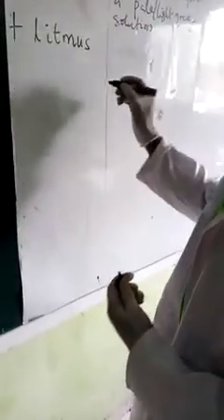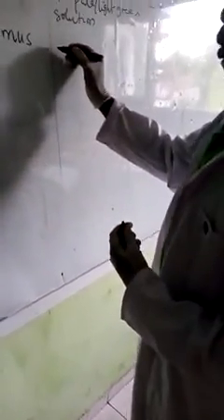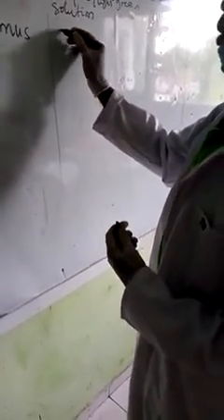Wow, you can see now. It has turned the blue litmus to red. So what will be the inference now? So we come back to our test. I will now say plus litmus, or you can say C aqueous plus litmus. Anyhow you want to write it. Say plus litmus.